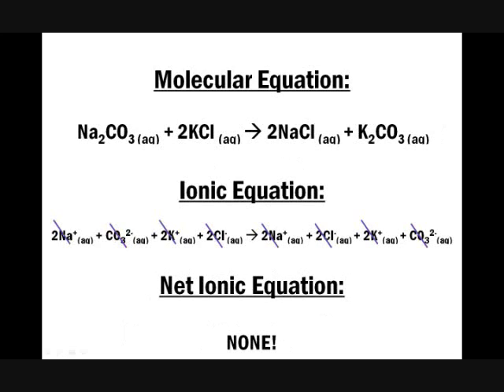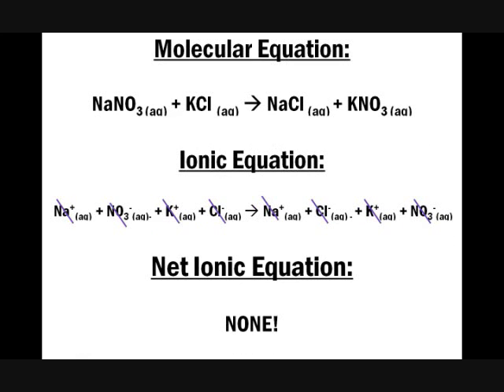Both products, sodium chloride and potassium carbonate, are soluble. The solutes will dissolve in the solvent. The solution is unsaturated, therefore no precipitate formed because the solution hasn't reached its maximum peak in dissolving solute. That's why no precipitate forms and no equilibrium forms.